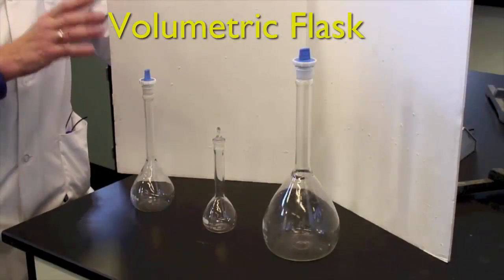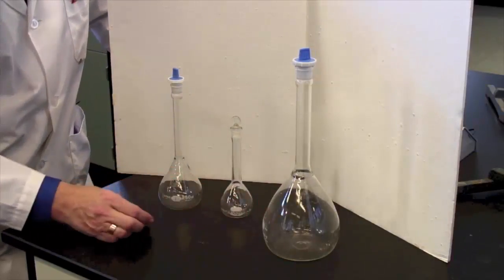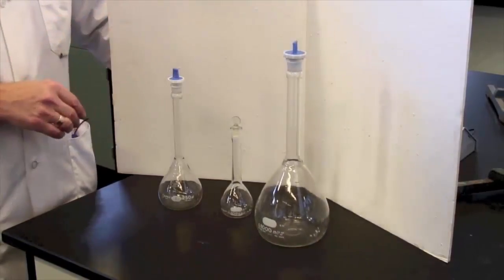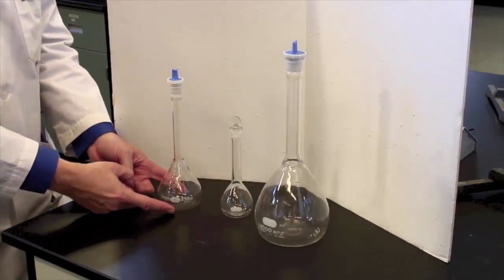You need to have particular pieces of equipment that are made for volumetric analysis. For containing accurately known volumes, we have volumetric flasks. And we've got three different sizes: 100, 250, and a liter. They come in many different sizes.